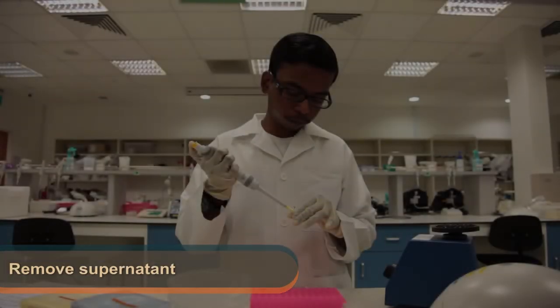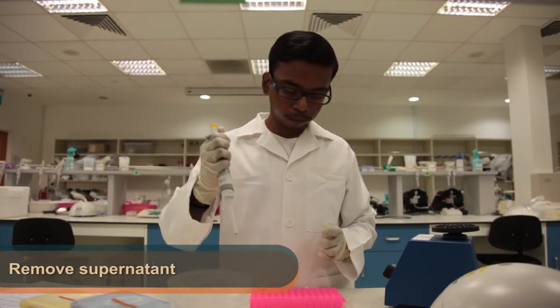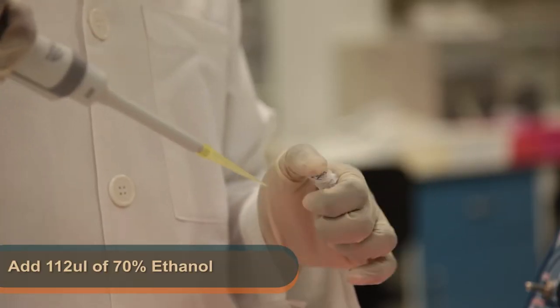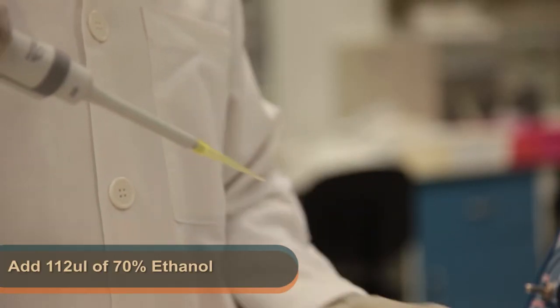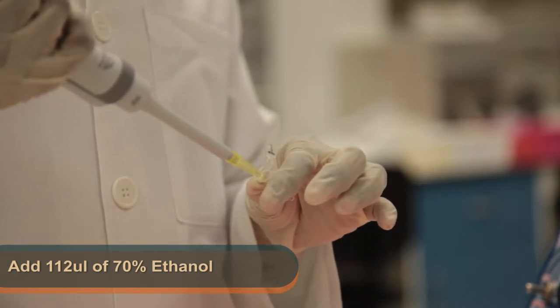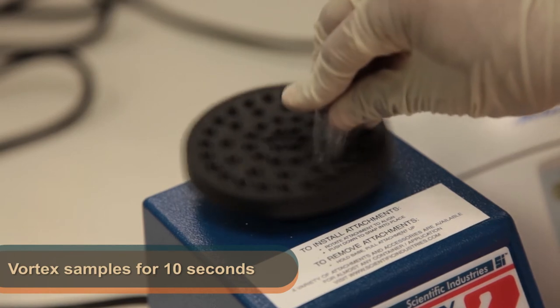Following this, carefully remove the supernatant without dislodging the cell pellet at the bottom of the tube. Then, add 112 microliters of 70% ethanol into the tube. This amount is twice the original sample volume. Vortex the sample for 10 seconds.